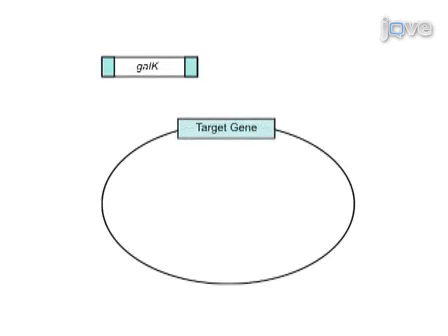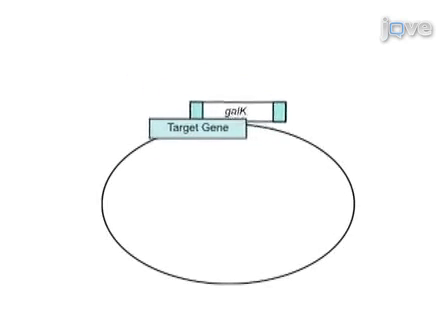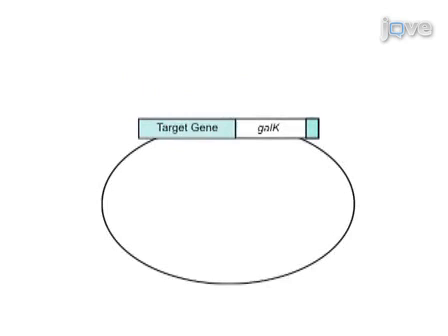As a second step, the galK gene is inserted into the desired location in the fosmid, which marks the site where the GFP or TAP tag will be placed. Next, the galK gene is replaced by GFP or a TAP tag via homologous recombination, followed by negative selection using deoxygalactose in order to create the modified transgene. Results are obtained that show these transgenes can be created quickly and successfully, based on verification of tag insertion by colony PCR.